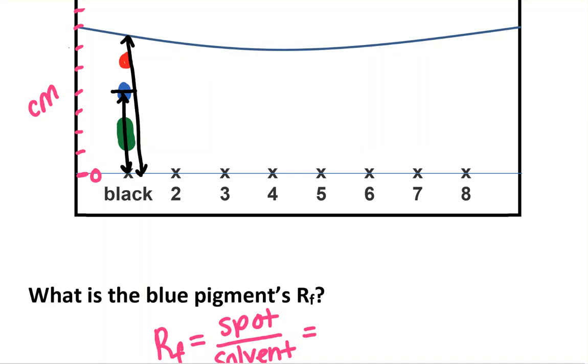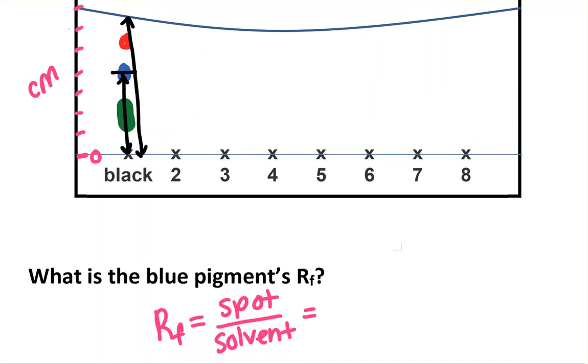Okay, so let's take measurements for this. Since my ruler only has a line for every centimeter, I'm just going to go one past the decimal. Actually, 1 past the decimal for your sig figs makes sense because these spots are so big, we're estimating the middle of them.